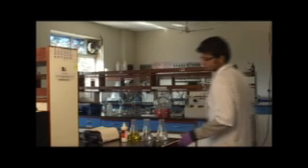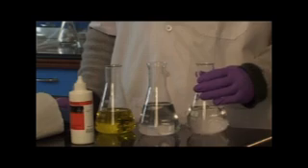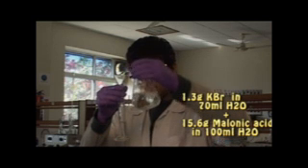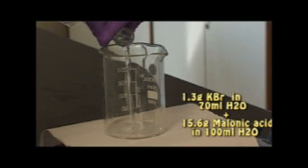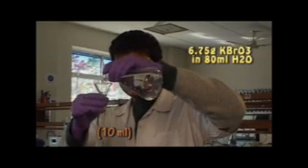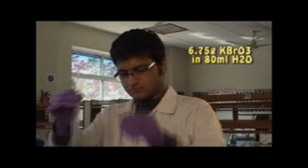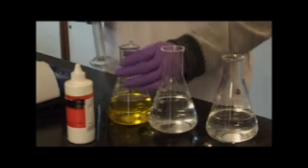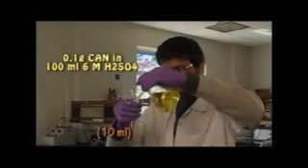Let's take a look at the reaction. We need three solutions: a solution of potassium bromide and malonic acid, an aqueous solution of potassium bromate, and a solution of acidified cerium ammonium nitrate. Stir the mixture using a magnetic stirrer.